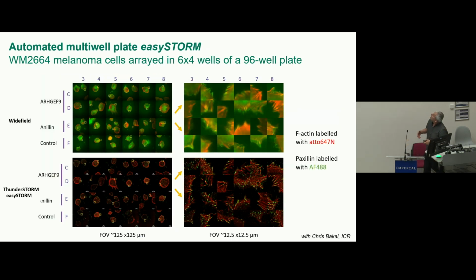Now, this is only one single slide, and in pharma you need a large field of view, 96 well format. We try to bring single molecule localization microscopy into high content analysis. In this 96 well platform, you can see a drug screening. Every well has the same cell line, but challenged with different drugs, in this case siRNA interference.